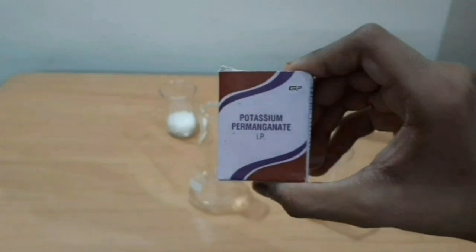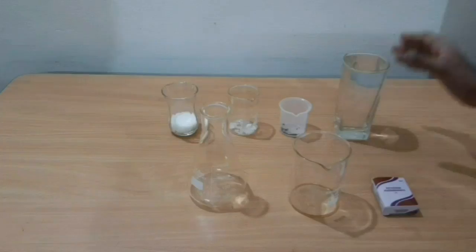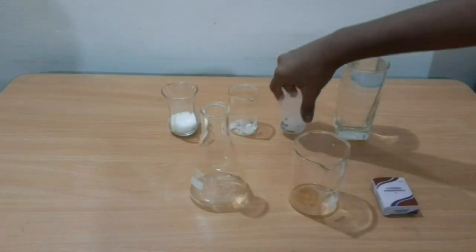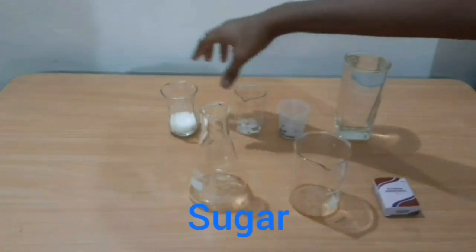First we will see a color change reaction. For this activity we need water, potassium permanganate, sodium hydroxide, and sugar.